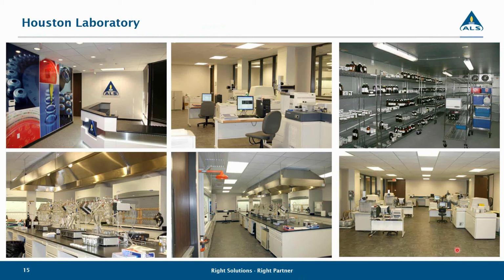But because of the isotopically labeled standards and the precise nature of our testing, you have three things going on when you identify using high res. You have your two most abundant ions quantified by the mass, plus you have your retention times. And because of the precise nature of the high res testing, even when the labeled standards are down to 10%, we can positively identify the compounds. It's really amazing, the technology that we have. But according to our method SOP, we do report data as long as those labeled standards are 20% or above.